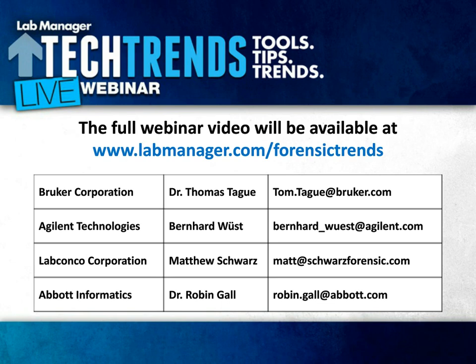Some of the returns you would expect to see would be increased efficiencies within your laboratory. In an electronic system, you should not need to rekey information. You should not have to be looking for lost paperwork and misfiled paperwork. The other thing that you're going to get an advantage on is less human error. If you have a LIMS system that you're interfacing to your analytical instrumentation and you're pulling those results into the LIMS, you don't have somebody sitting there keying in the numbers and possibly making a typographical error. It also can organize all of this data very nicely for you.